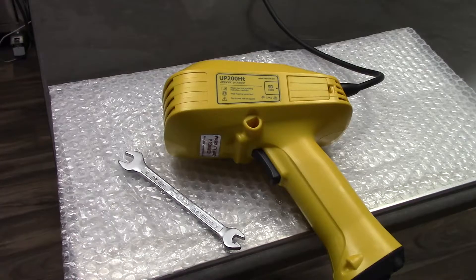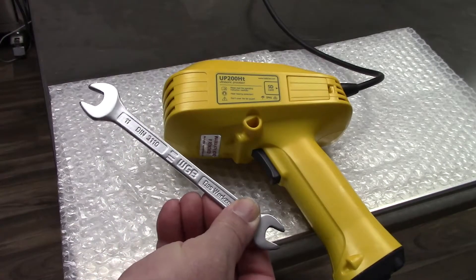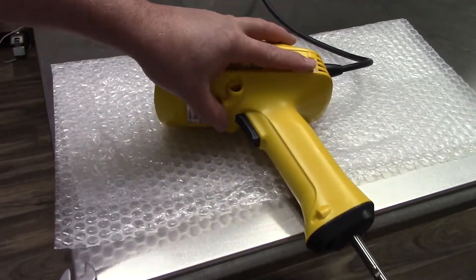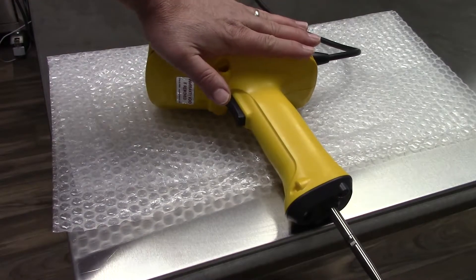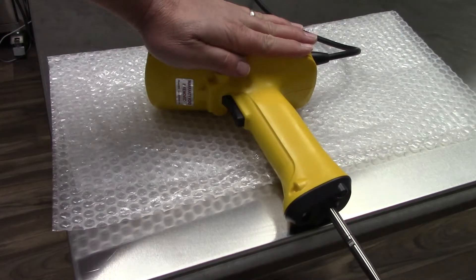Let's begin. Using the wrench that was supplied in the case upon your purchase, I'm going to apply force with my left hand at the top of the unit, going across the unit.